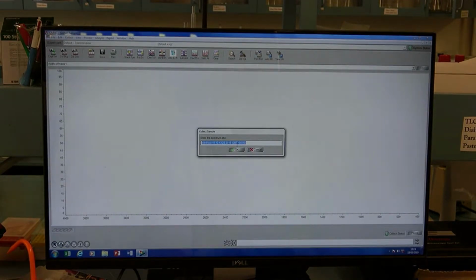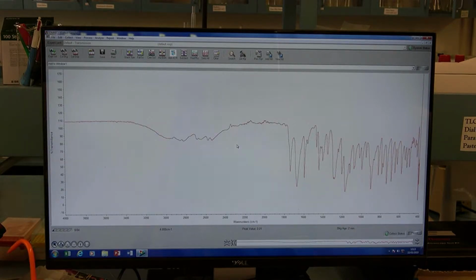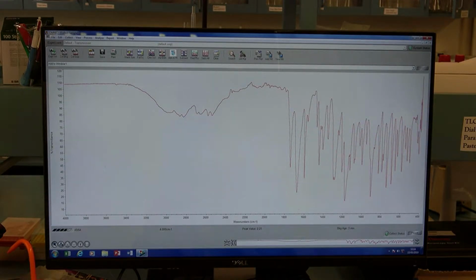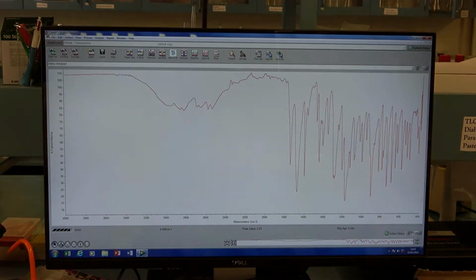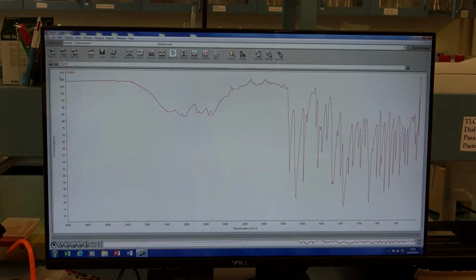Omnic first asks you to name your sample and accept. The collection of a series of samples then restarts. This is done in order to increase accuracy. Here, 64 samples are being collected, but the amount can be lowered in favor of speed. Usually around 32 samples are collected. After this process is finished, we add the spectra to a new window by selecting Yes.